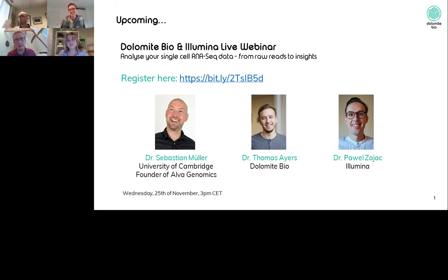So that is due to the fact that the Nadia Innovate is an add-on module that doesn't have pressure pumps in it. So what it does is it hijacks the pressure pumps from the Nadia, and using tubes which are attached to a special breakout cartridge, we then take that pressure and pump it through into a single chip that we can look at using that microscope. Because we only have one microscope, you can only look at one chip at a time, so you might as well just do one at a time.